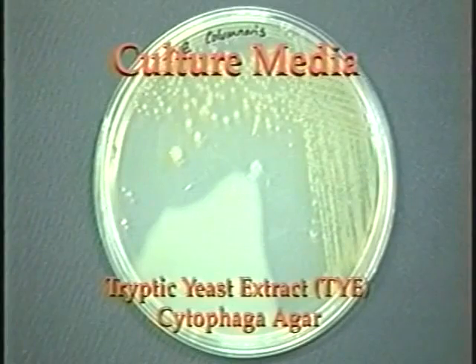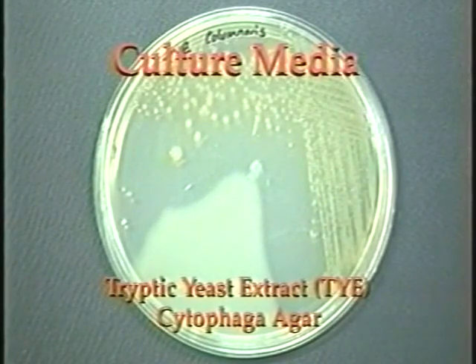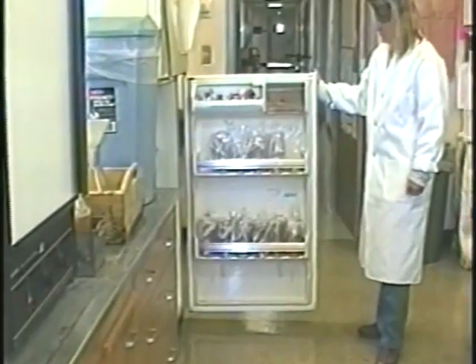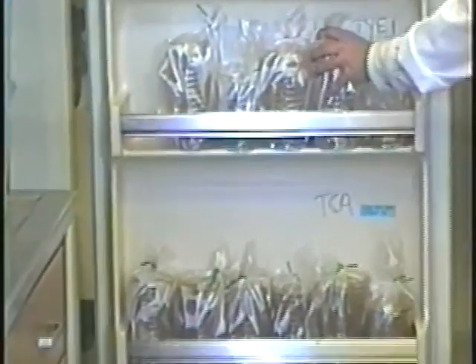In addition to this general media, it is common to inoculate tryptic yeast extract or cytophaga agar if infection by a member of the Flavobacterium group is suspected. Media must be prepared aseptically, and agar plates should be stored in the refrigerator stacked in canisters or plastic bags with the agar surface uppermost to prevent pooling of condensed water.